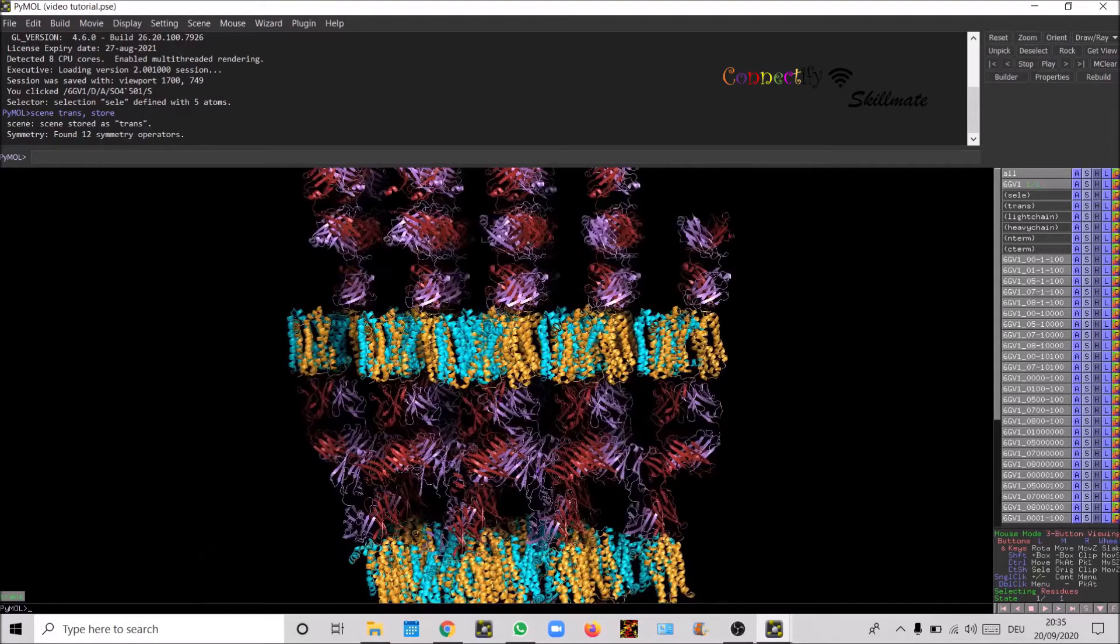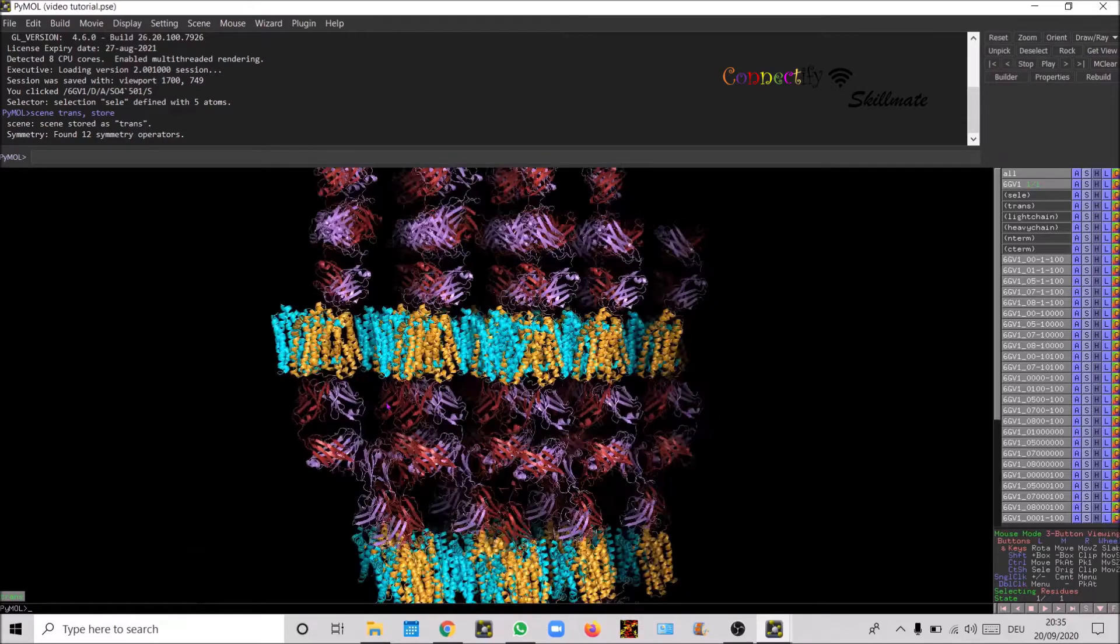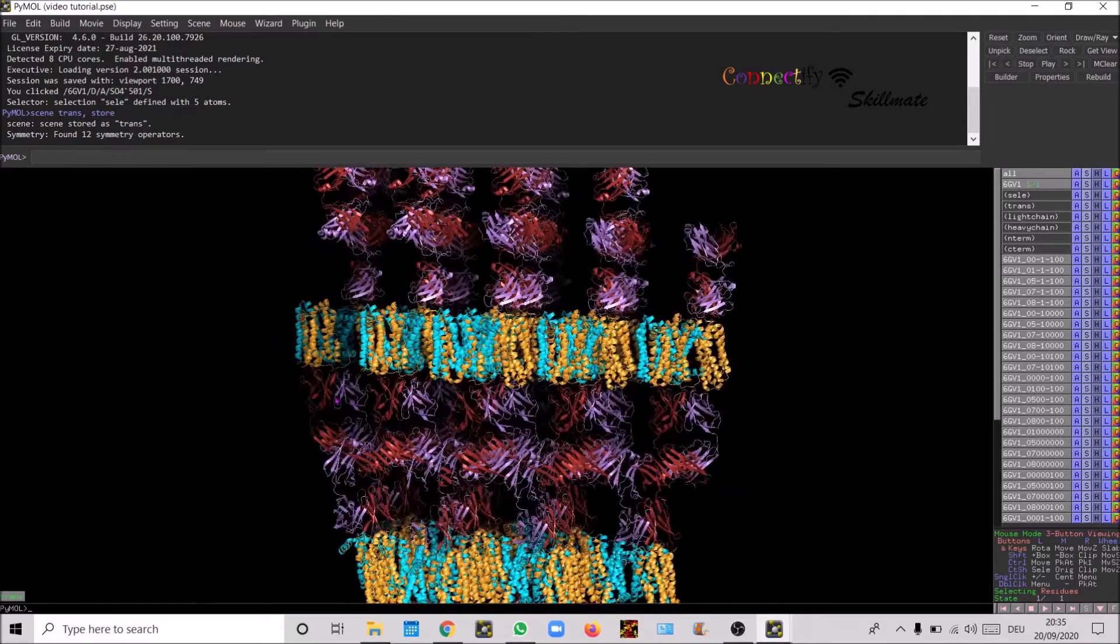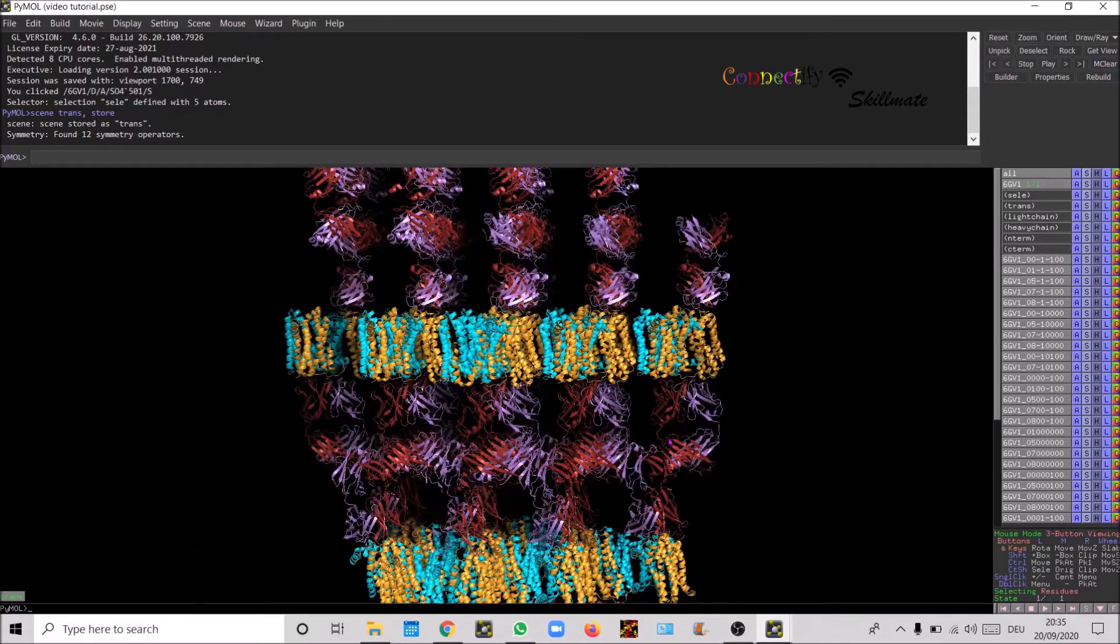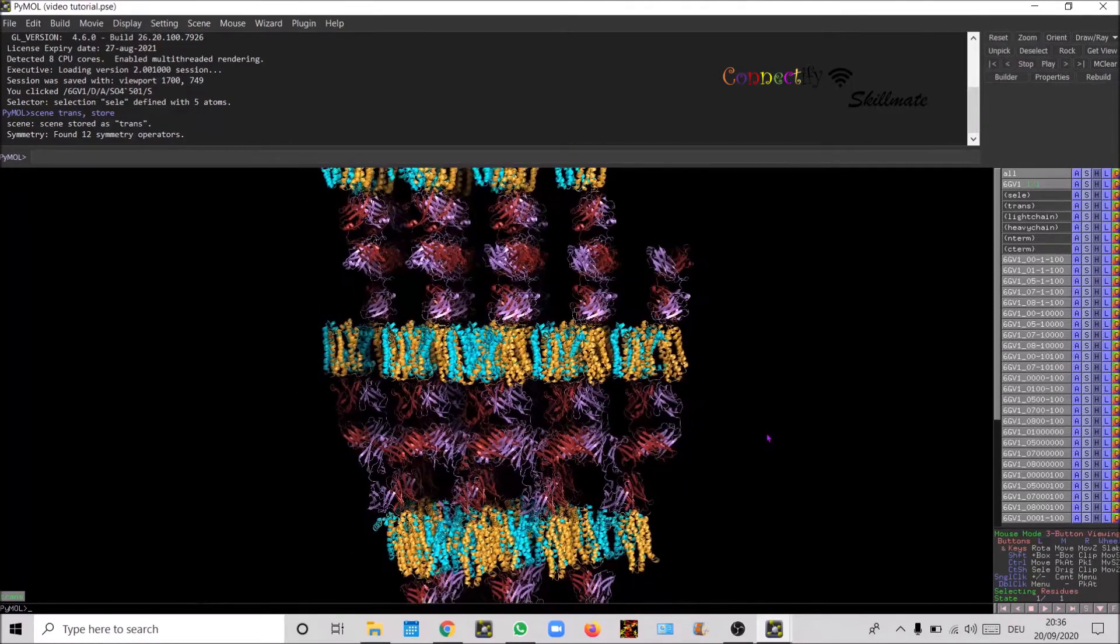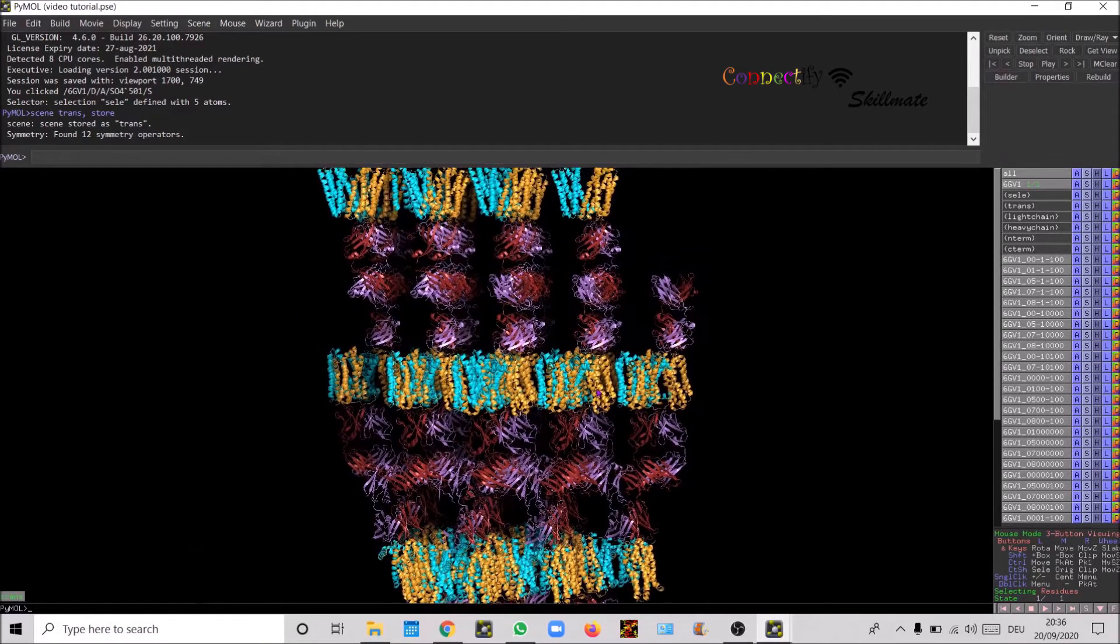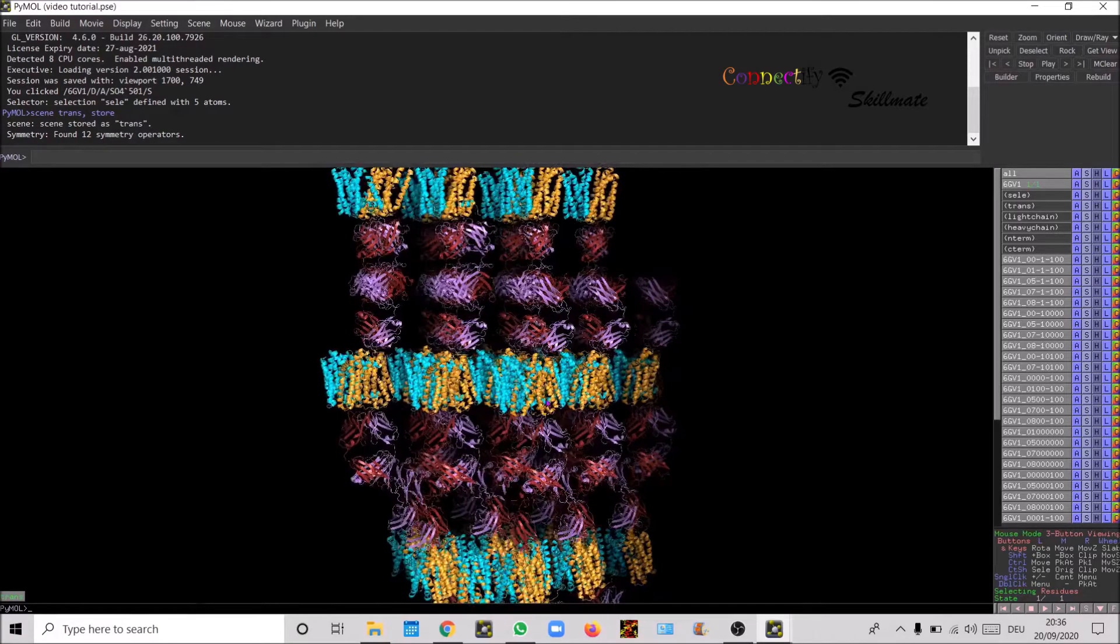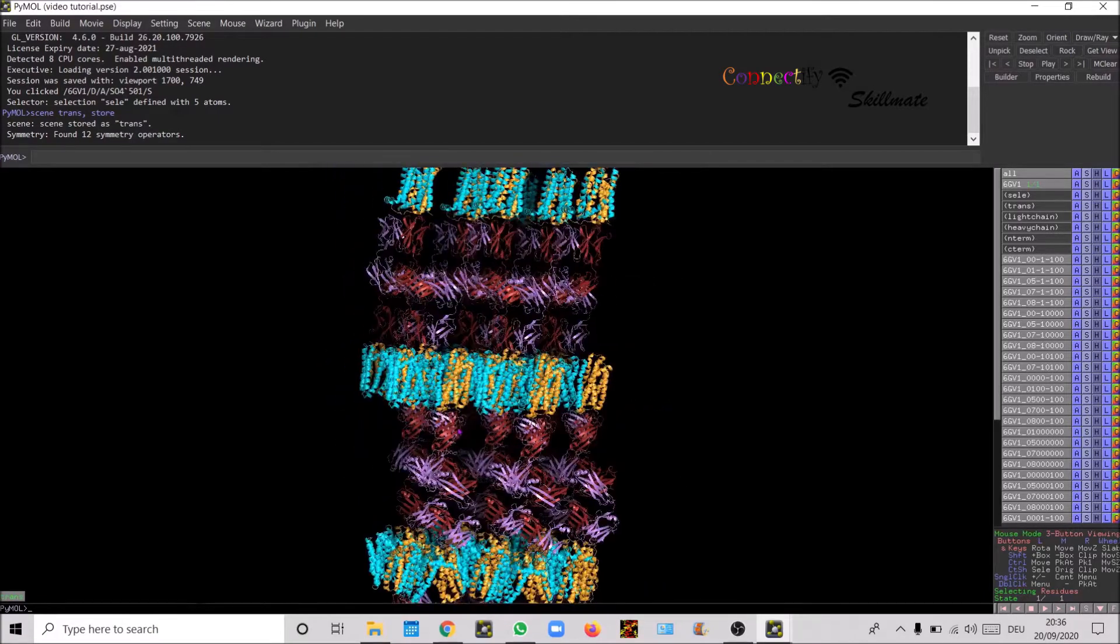The fab molecules are found on the aqueous channel where the transporter is very nicely found on the lipidic bilayer. This is a type 1 interaction. Now we want to show the crystal packing.